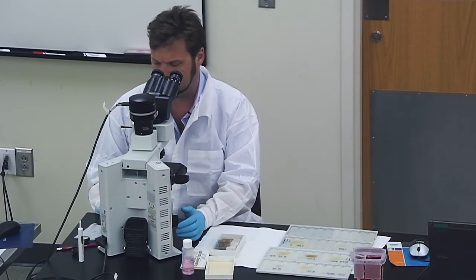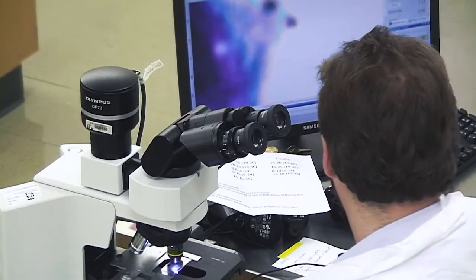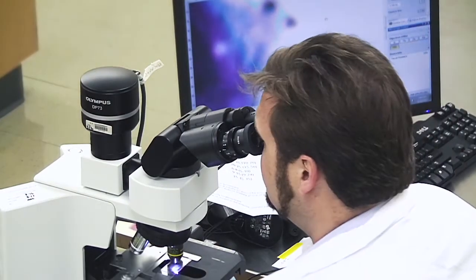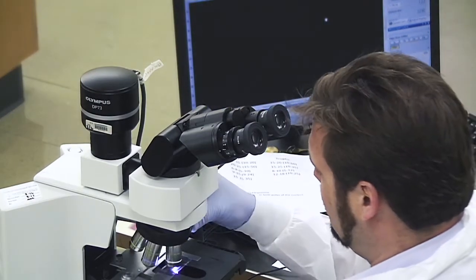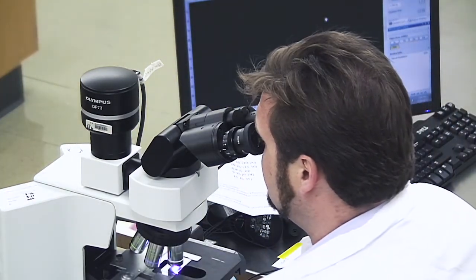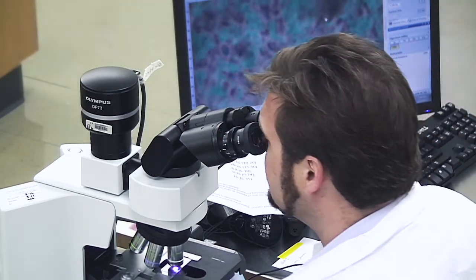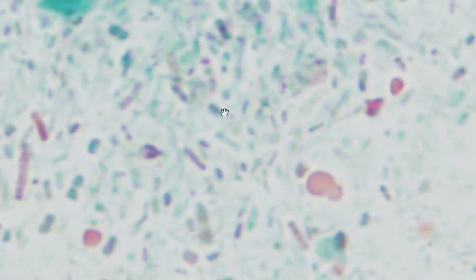Most of what I'm going to show you are trichrome stains, because that's the most commonly used stain in the United States. I have used a lot of iron hematoxylin, and I'm quite fond of it. But for the purpose of this, we're going to show you trichrome stains. So I'm just going to bring this into focus now and correct for white, and then we're going to move on. Let's just do that correction. Okay, and now we're going to have a look at this particular slide here.